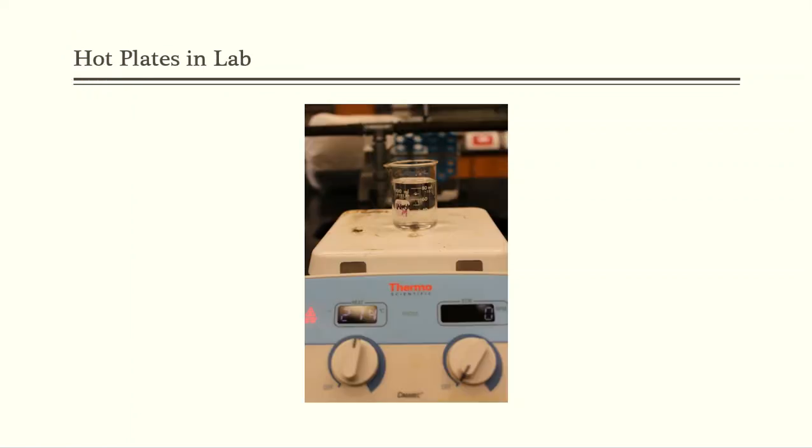So zooming out a little bit, here is that same beaker with water, and this is the hot plate that we have in our laboratory. This hot plate runs around $550 a piece. Again, just giving you some prices of things in a laboratory that you might not have known. And we probably have 20 to 25 of these particular type of Thermo Scientific hot plates.